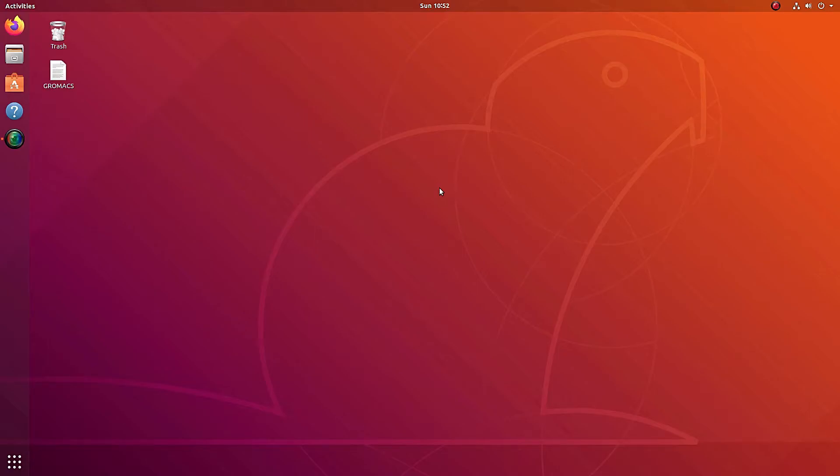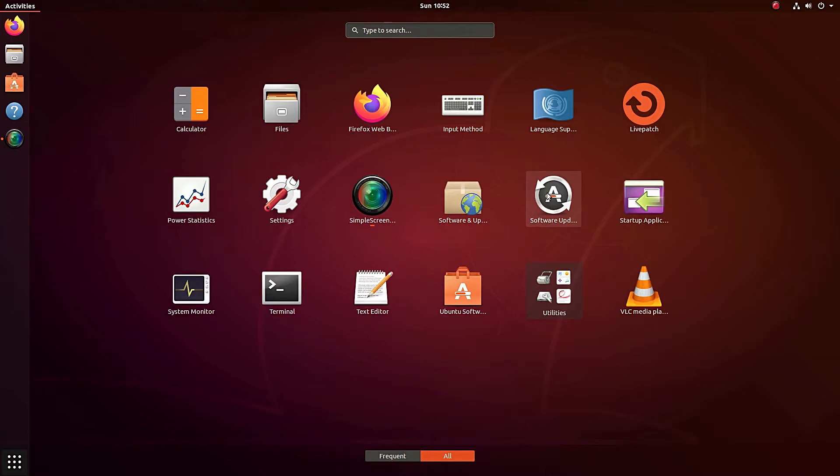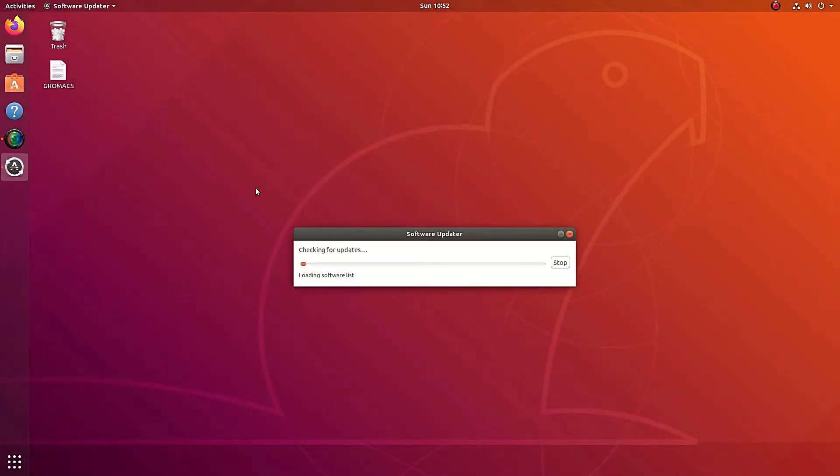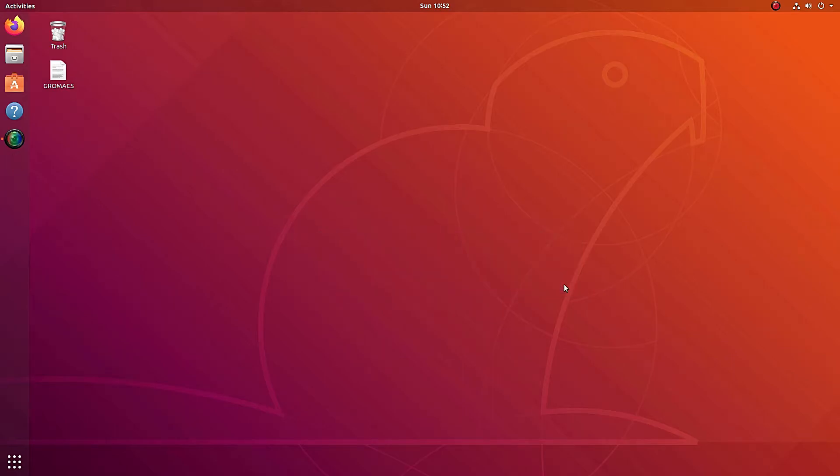Alright, so assuming you have already installed Ubuntu. There are a couple of things I need to tell you before we start installing GROMACS. First of all, make sure that you have installed all your updates. If you press the Windows and A key at the same time, you should have this pop up. These are all your apps currently installed. Click this icon over here. And the software updater should pop up. Make sure that it's up to date. This should be done automatically once you log in for the first time. But just make sure that it is up to date.